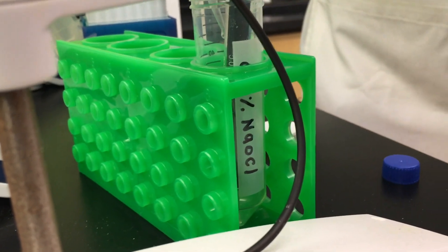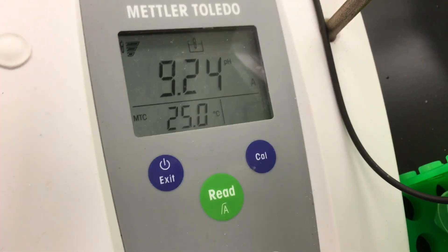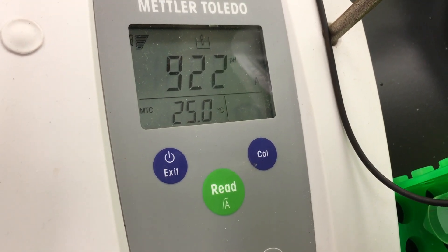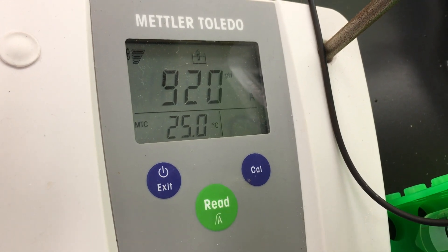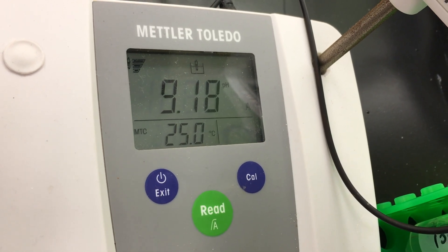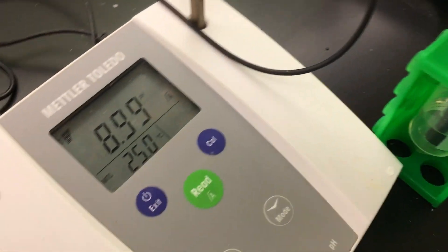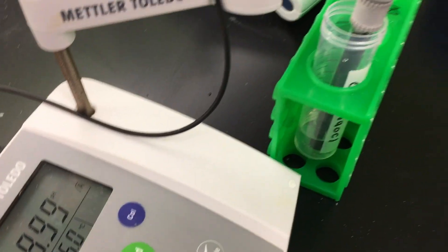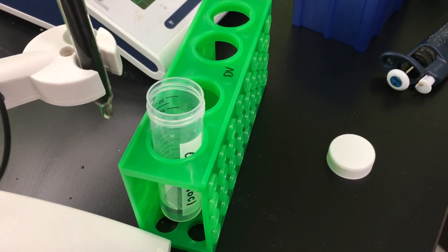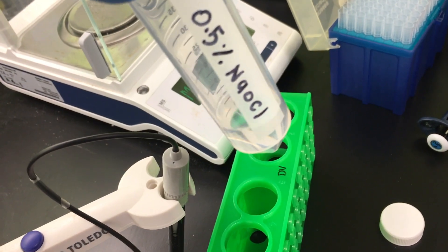We add the sodium bicarbonate drop by drop while observing the pH monitor. About eight drops have been added so far, though the exact number depends on the total volume of buffer you want to prepare. After two more drops, we have finally reached pH 9. Now we have our ducking — docking — solution ready: 0.5% sodium hypochlorite with a pH of 9.